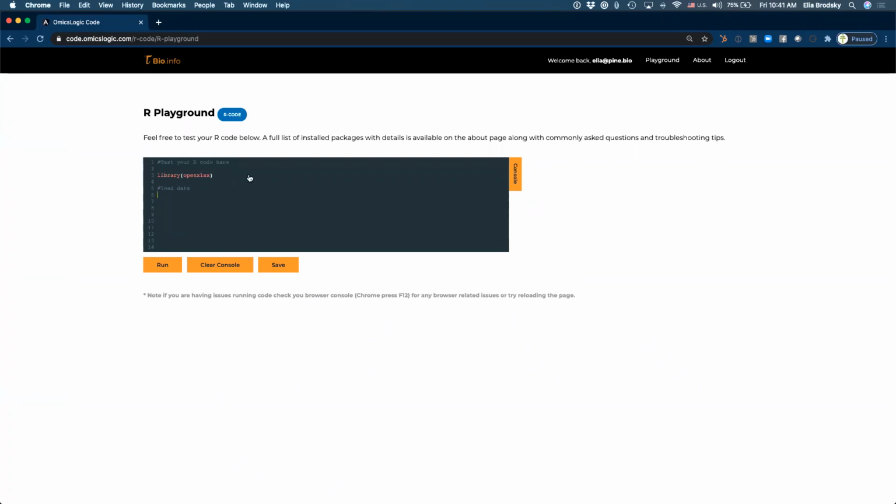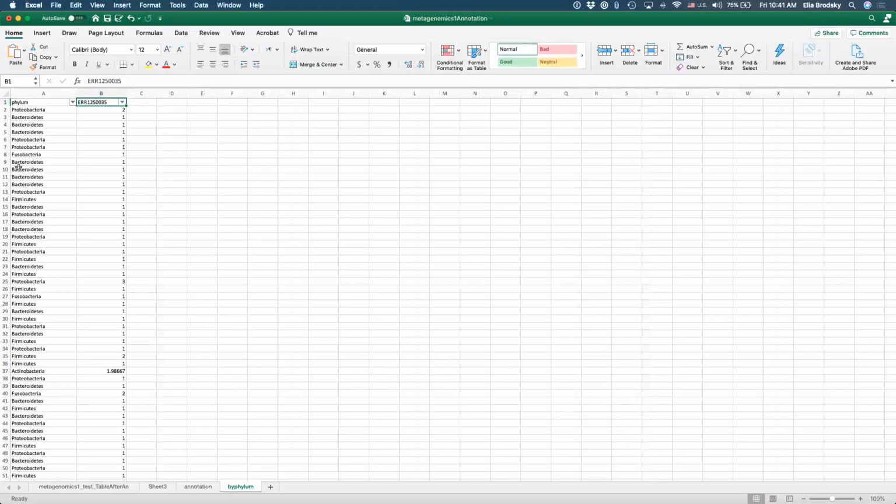So what we're going to do is we're going to have the actual data. So if we go back to our file, where is our numeric data? Where can I, in my table, where's the numeric data? Right, column B, right? So column B, but without this guy right here, right?